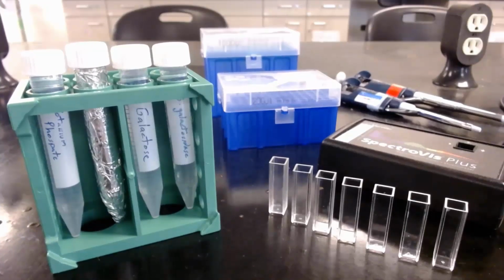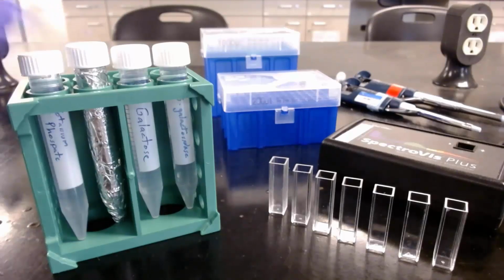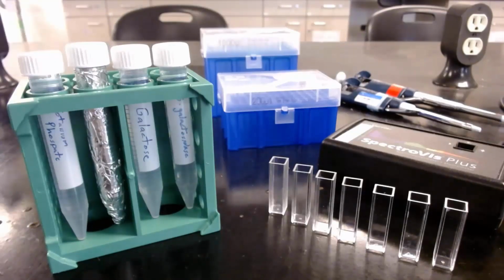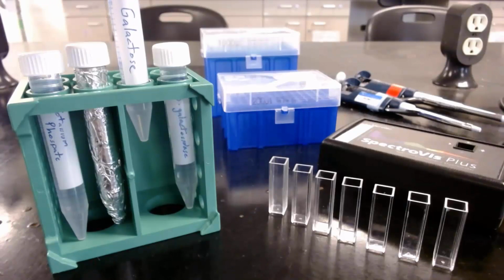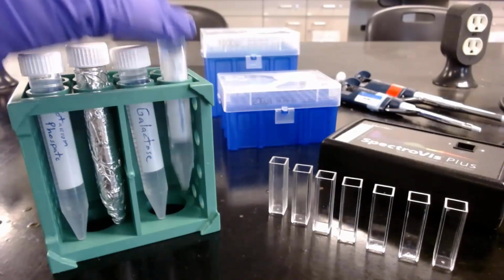Here I've set out all the equipment we'll need for our assay. This is our buffer, potassium phosphate, O-nitrophenyl beta-galactoside, or ONPG, which will be our substrate for the reaction. More on that in a moment. It's wrapped in foil since it's a little light sensitive. Galactose, our hypothesized inhibitor, and our enzyme, beta-galactosidase.